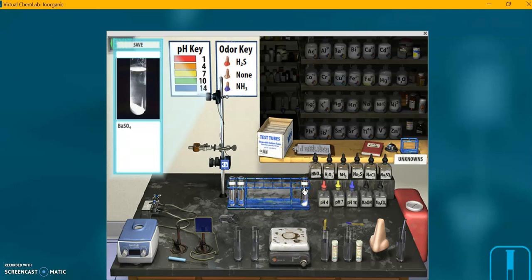I could drag it over, throw it away. Maybe I'll do that. But whatever you do, don't click on that red can, that red waste can, because that'll clear your lab out.